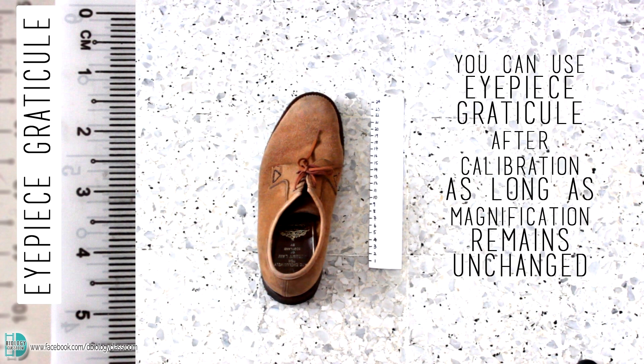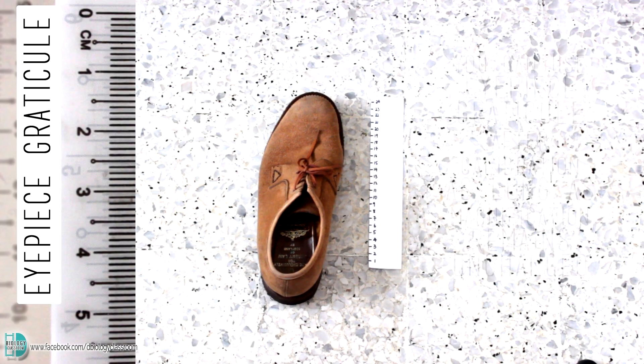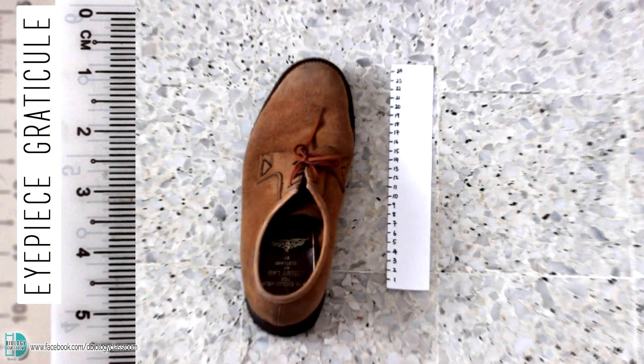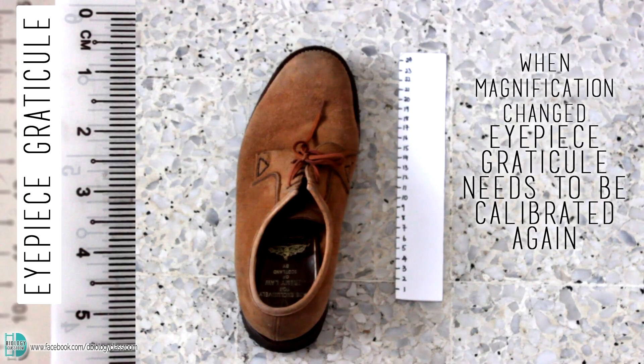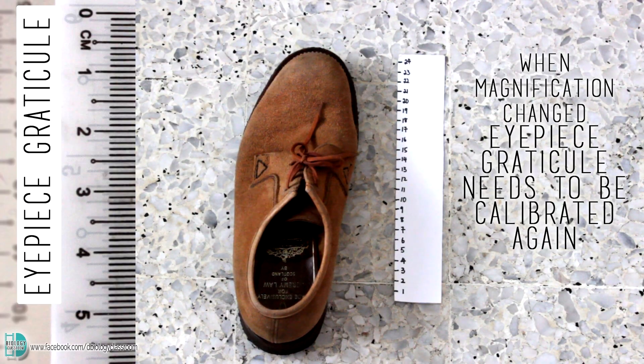After the calibration, no matter what I place on the stage, as long as I don't zoom in and out, I can use the ruler at the lens to measure them. However, if I zoom in, I need to calibrate the ruler again, as its reading is now changed. So when you are using the microscope, you have to calibrate the eyepiece graticule every time you switch from one objective lens to another.